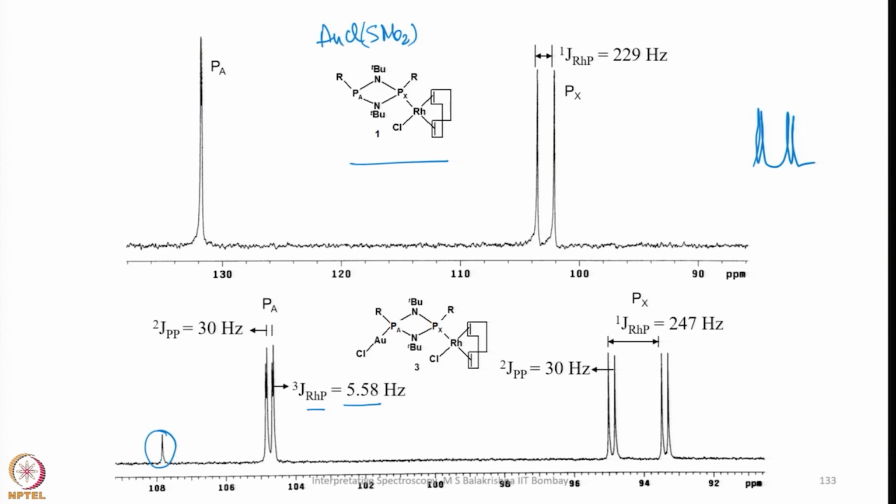So interpretation is easy, and we also came to know that suddenly the phosphorus-phosphorus coupling is increased when both the phosphorus are coordinated. It is now very interesting to look into the electronic situation at both the phosphorus with some theoretical background or calculation, DFT calculation and other things, that might tell you why the PP coupling is very intense compared to the compound where only one phosphorus was coordinated. So this is for this one, as I mentioned here.